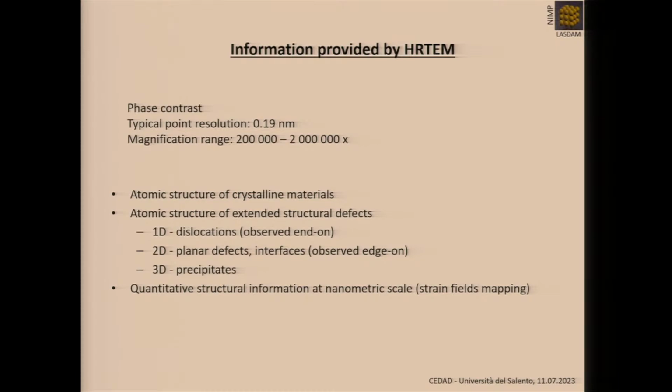Or structural information at the atomic level about planar defects, interfaces, also when observed edge-on, or about 3D defects, precipitates. Moreover, we can obtain quantitative structural information at nanometric scale by measuring the strain fields, by mapping the strain fields associated to these defects.